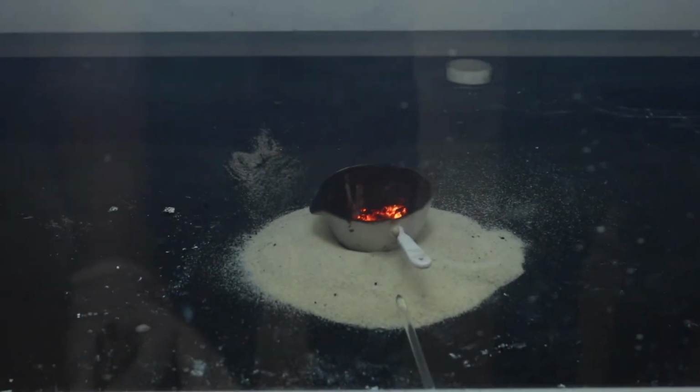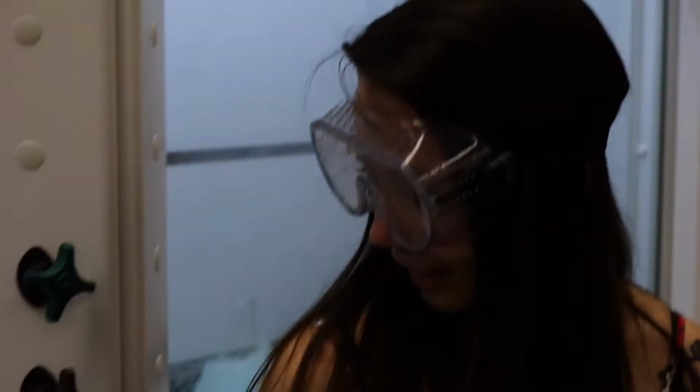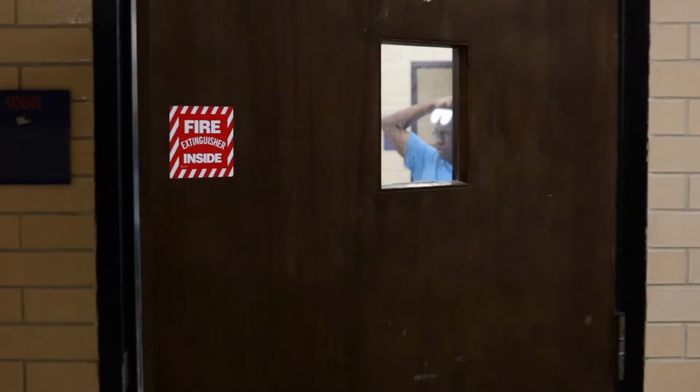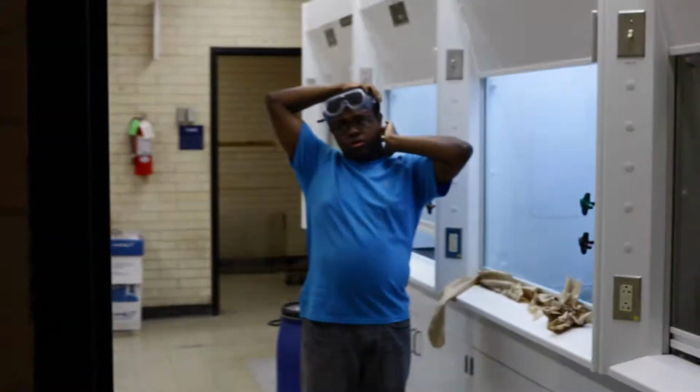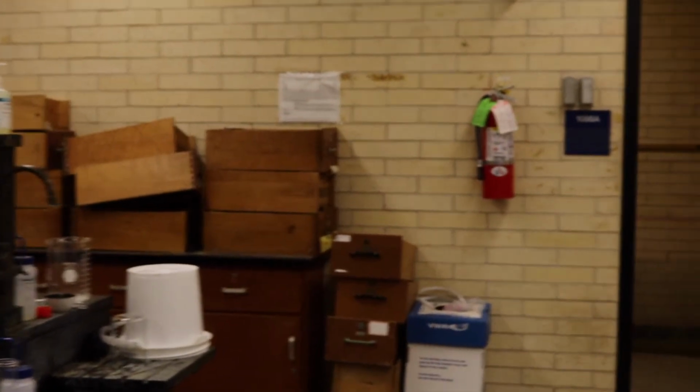Oxidizers such as potassium permanganate take electrons, while reducers such as glycerin and glycerol give electrons. Together, this creates an exothermic reaction, as mentioned before, and a redox reaction. This concludes our reactions, but now it's your turn to react. Hopefully yours is positive and does not emit gas.